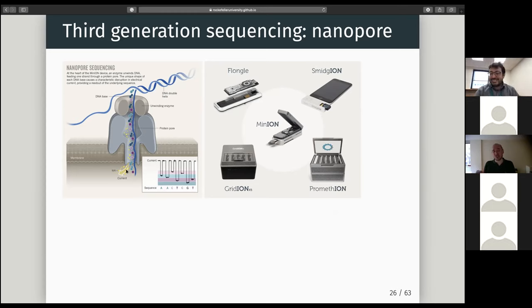And actually, if I recall correctly, it was reconstructed afterwards, because the machine doesn't even support it. The algorithms don't even support it. When you see a super long molecule like that, the software thinks it's more than one molecule and is going to chop it into pieces. So they reconstructed it afterwards. Don't expect that kind of output all the time. What you should expect are 50 KB, 80 KB. It's a very nice and very cheap sequencing type.